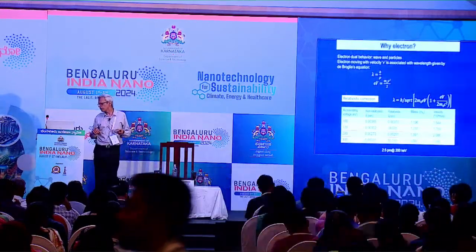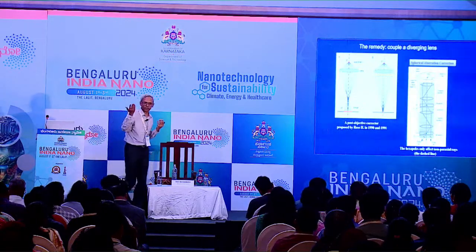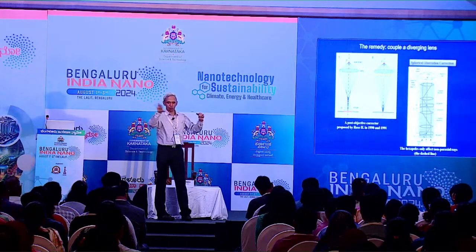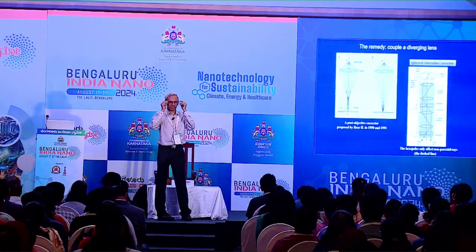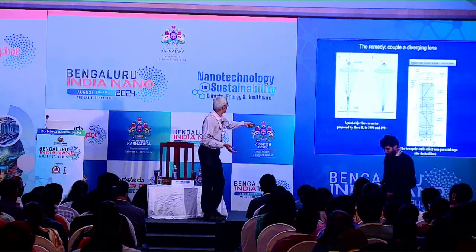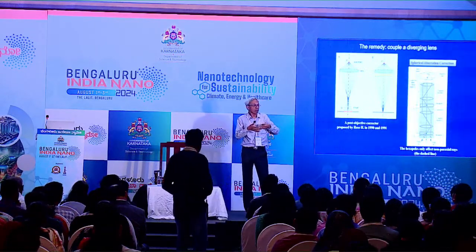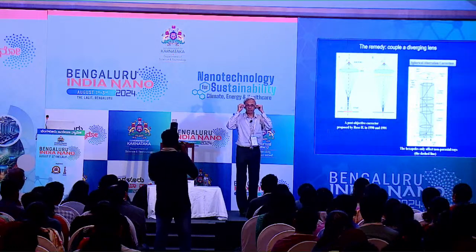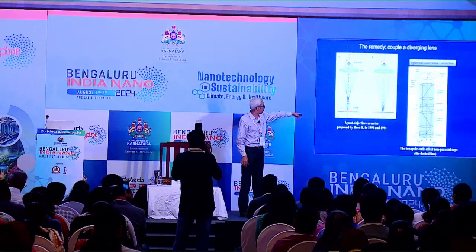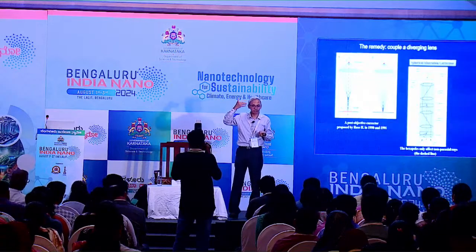One of the points I want to make is that many of you are wearing glasses because of spherical aberration. If I remove this, the whole thing looks like a blur to me, and when I wear this, everything becomes bright again. So what is happening? Because things are getting blurred, things are not getting focused at the same point. But once you have a diverging lens, the glass we have here, it acts in the opposite way to our eye, and therefore we can get point convergence again. This is how we correct for spherical aberration.